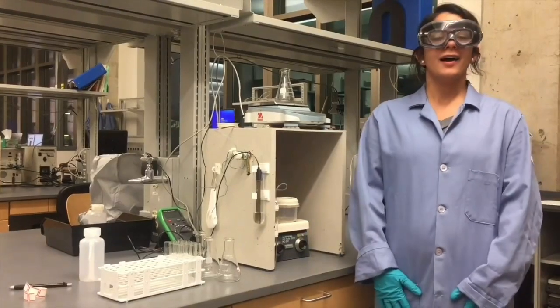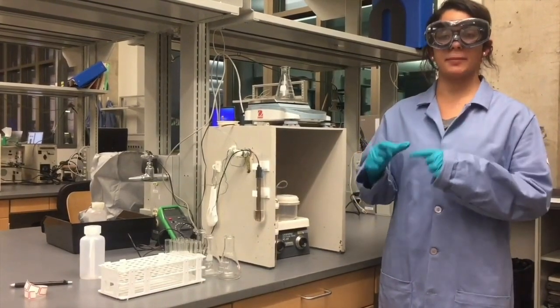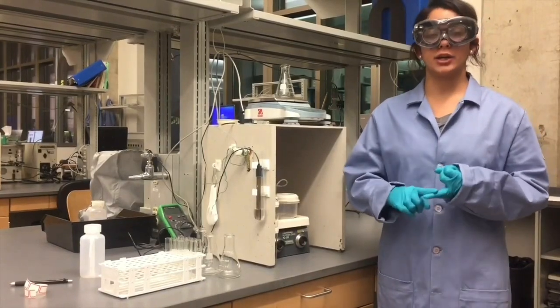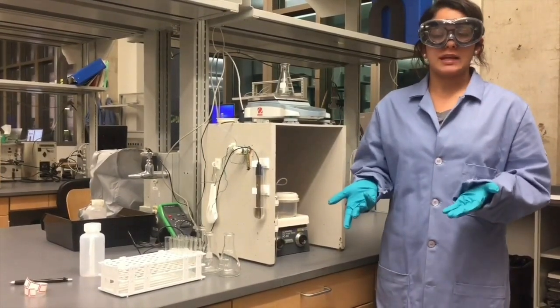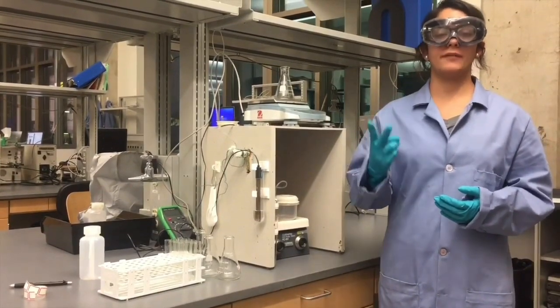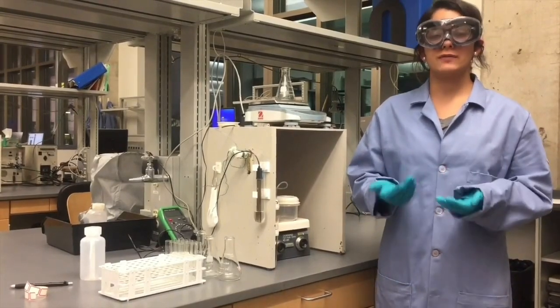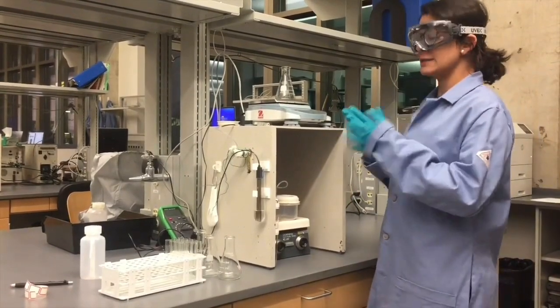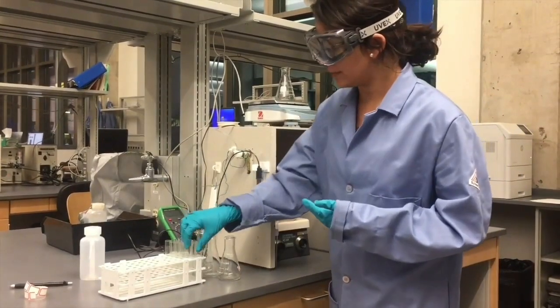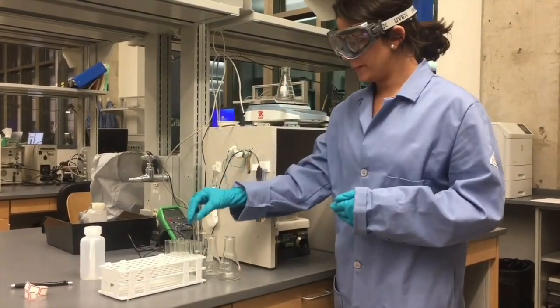Great question, Henry. Whenever purchasing or using an ICP, there is a specific appendix that will list all of this information, including the detection limits and the linear range. You always have the option to create these standards using 2 different dilution techniques, either by mass or by volume. Because of our specific preferences here at the Norway Valley Lab, we have chosen to do these dilutions by mass. Once these dilutions are made, we will fill up these test tubes just about 3/4 of the way, and then they're ready to go.